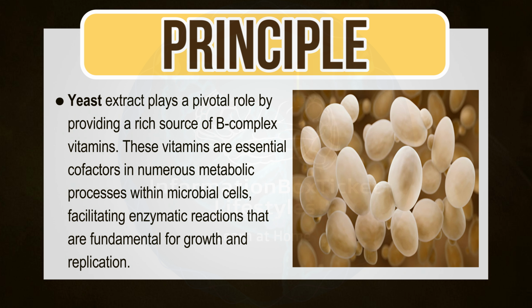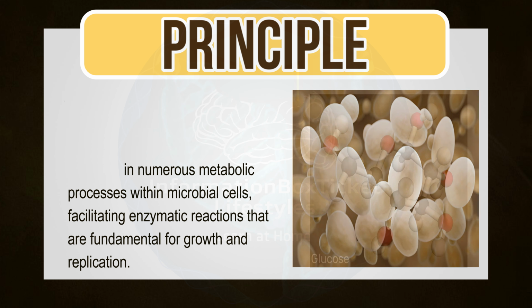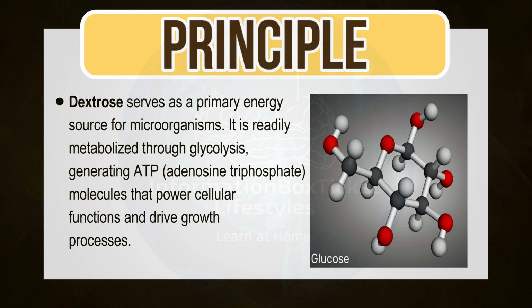Yeast extract plays a pivotal role by providing a rich source of B-complex vitamins. These vitamins are essential cofactors in numerous metabolic processes within microbial cells, facilitating enzymatic reactions that are fundamental for growth and replication. Dextrose serves as a primary energy source for microorganisms. It is readily metabolized through glycolysis, generating ATP, adenosine triphosphate, molecules that power cellular functions and drive growth processes.